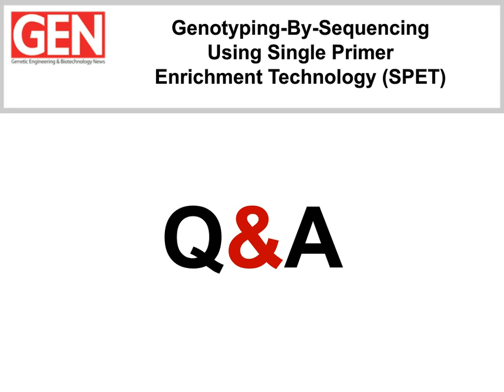And David, how can the sequencing platform and chemistry impact the performance of this method?